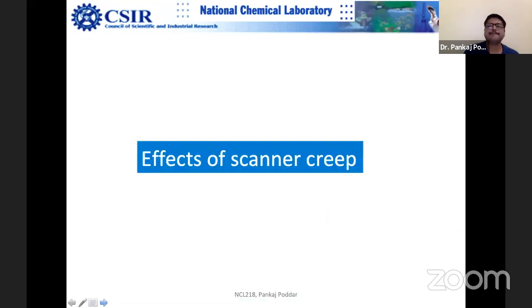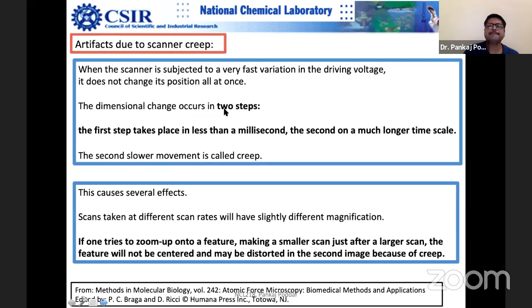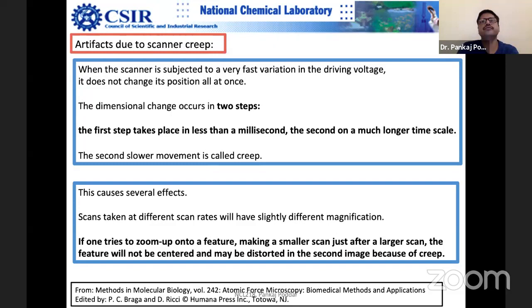Scanner creep happens because when voltage is applied, the dimensional change happens in two steps: one step takes less than a millisecond (fast movement), and the second step is a very slow continuing movement — this is the creep. So when you zoom from 50 microns scan size down to 1 micron immediately, you will have creep problems. You should reduce the scan size gradually: from 50 microns to 20 microns, then to 10 microns, then to 1 micron — slowly reduce so the scanner has time to settle.